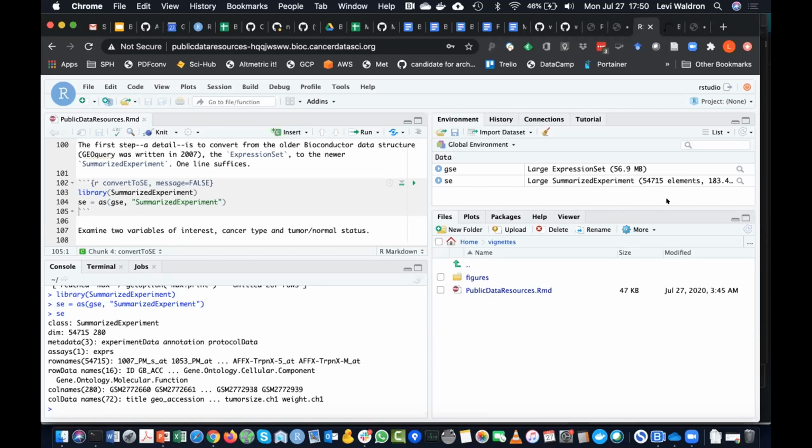Yeah. There's a great ExperimentHub package called scRNAseq that has curated data sets. So I'll write those out here, scRNAseq and Conquer. These are a couple of recommended ones. Conquer, by the way, uses a SummarizedExperiment to provide gene level and transcript level summaries of every data set, which I liked. I'm not actually familiar with scRNAseq.